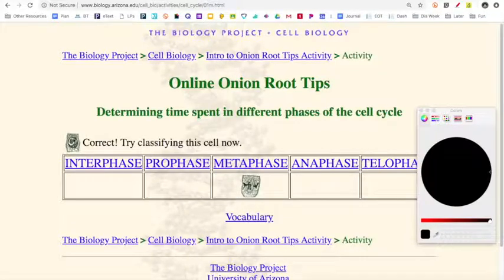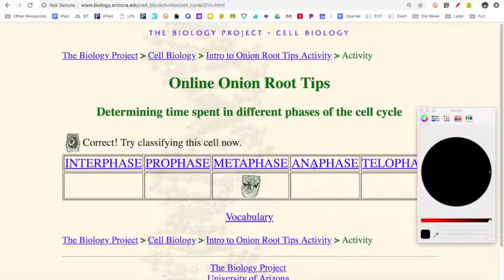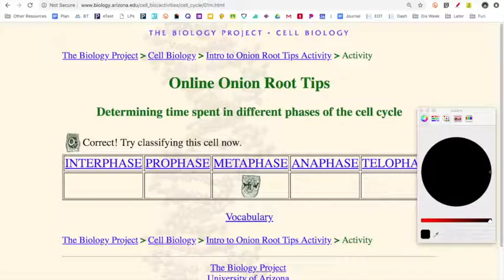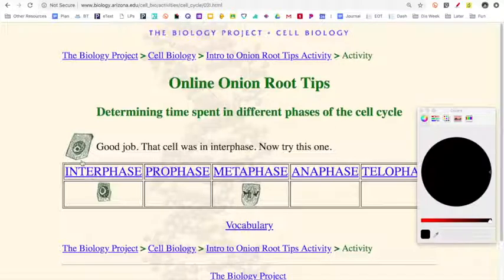Now it's going to give you a new picture. Here we can see there are no chromosomes — there's only one cell and we don't really see much of anything going on. So you should think: it's either telophase or interphase. There's no division; I don't see any chromosomes, so it couldn't be the other three phases. To figure out whether it's telophase or interphase, think: are there one cell or two cells here? If there are two cells, it must be telophase. If there's only one cell, it has to be interphase. So you can identify that's interphase and click it.